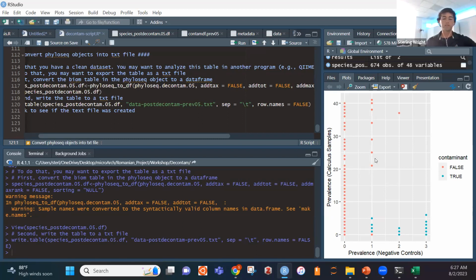We'll put the same reagents in those tubes as we do with our biological samples throughout the process, and sequence whatever DNA is in them at the end. That way we can make this comparison and see if we're getting any of the DNA that could be in the reagents or just in the laboratory itself, whether or not those are being introduced to our samples.